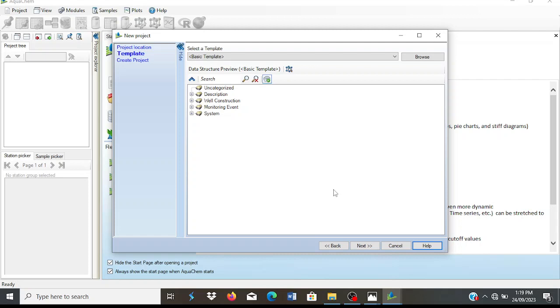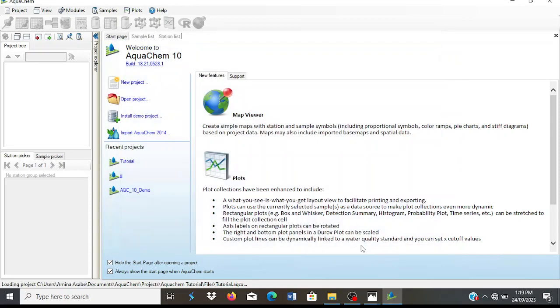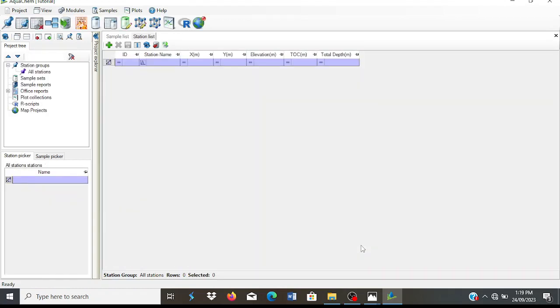Now, if you have this, then next is to click next and finish. Next is next, one, and then two, and then three, and then the last one, four, and that's working well. So I'm going to wait for a minute and see what happens. Yes, that's what I wanted. Now this is a plain project.